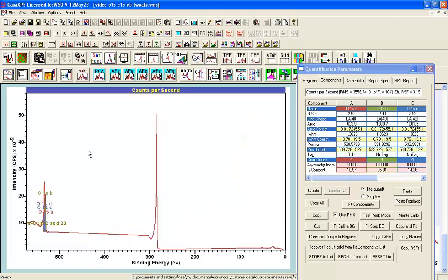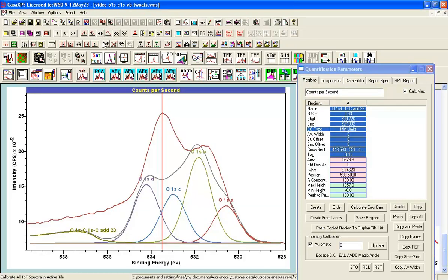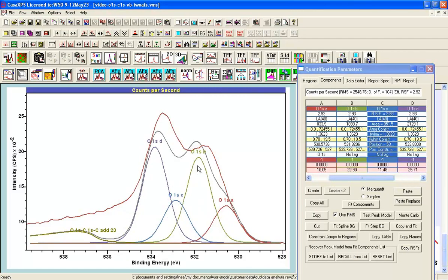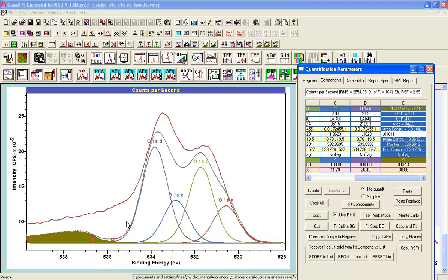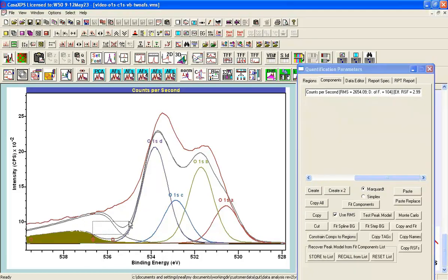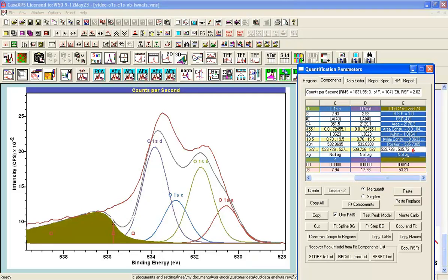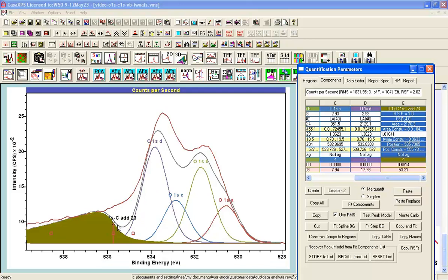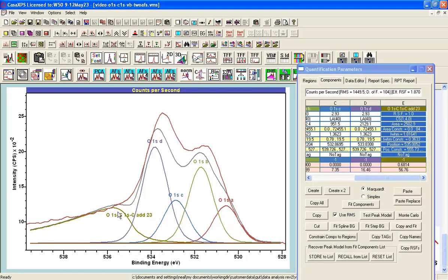This is one way of modeling data without being forced down the route of a Shirley or Tougaard background. The hope is we will understand the photoemission process better by having a component within the peak model that accommodates background signal. Zooming out and stepping back into the data zone using the region, before pressing Fit Components some adjustments are needed to get close to the expected solution. I also need to widen the range for this background component so it can move about a bit more.